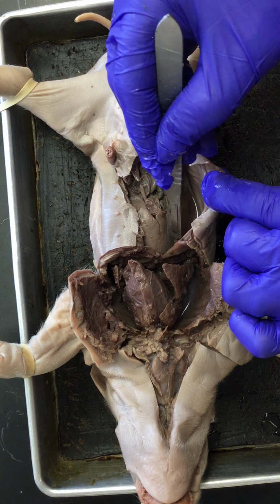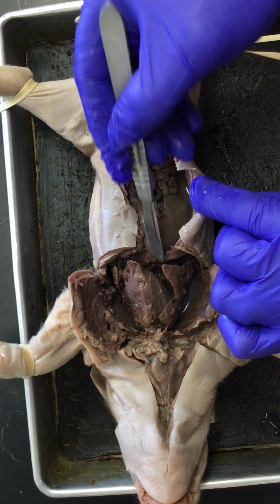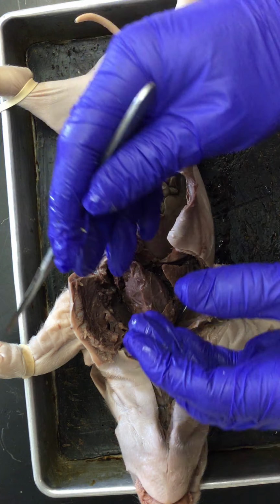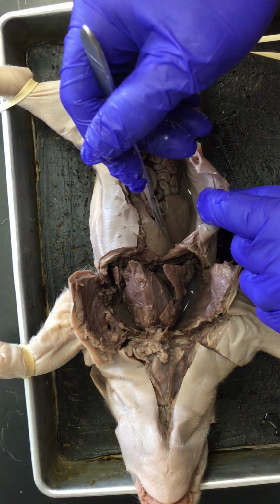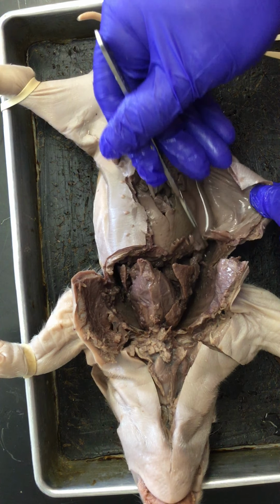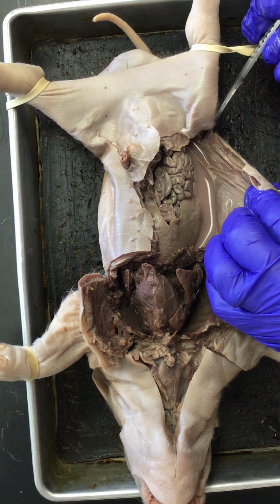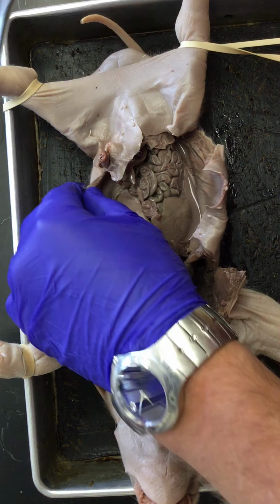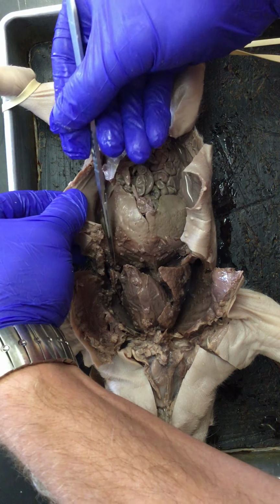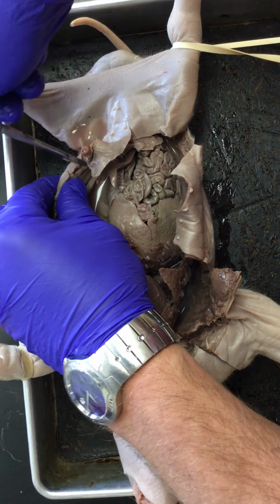This particularly strong muscle right here that I've cut through is the diaphragm. So this is the muscle that will expand and contract in order to make your lungs expand and contract. And so this diaphragm is a particularly strong muscle because that is the muscle that you use to breathe. I'm just going to have to do a little more shaving of the diaphragm in order to open up this abdominal cavity.